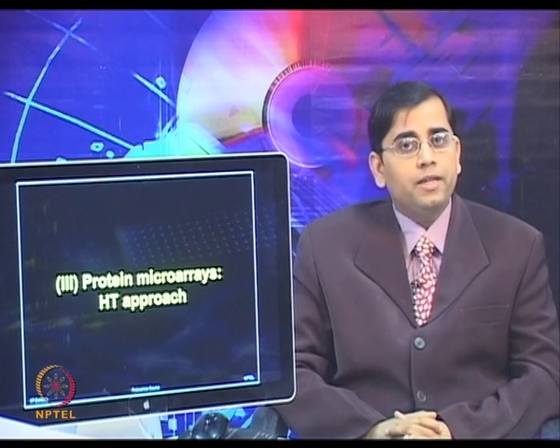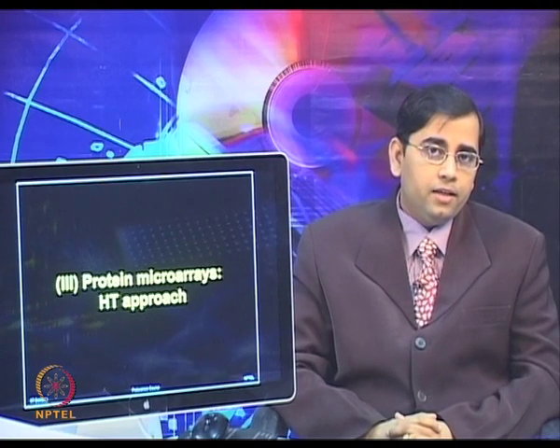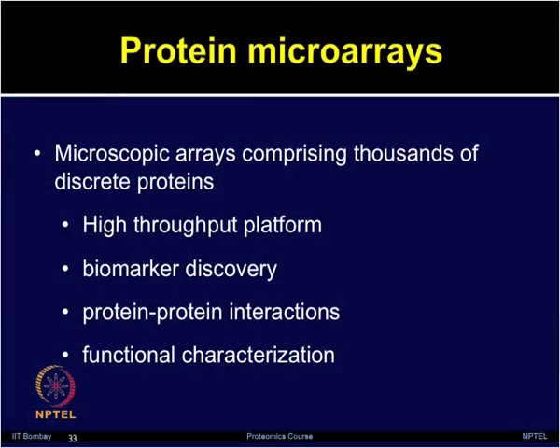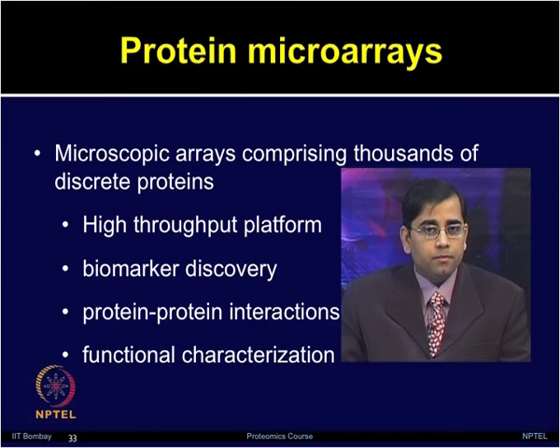The success of genomic technologies such as DNA microarrays has motivated the development of protein microarrays. Protein microarrays are microscopic arrays which comprise thousands of discrete proteins.